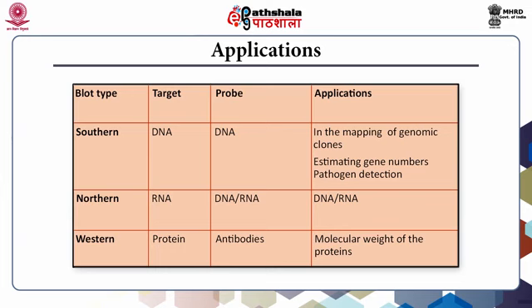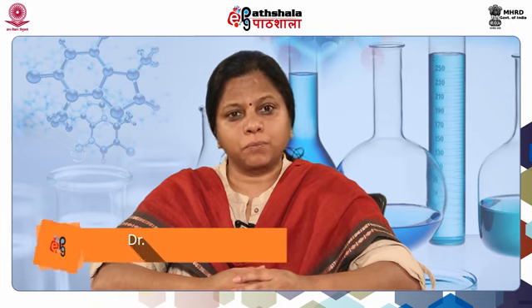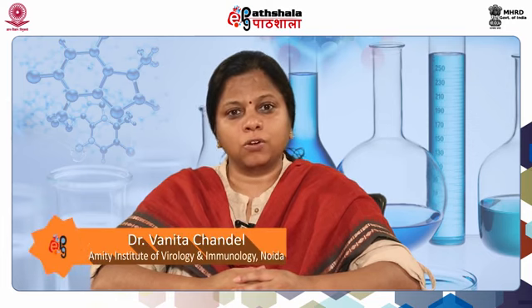of the proteins. So, students, after this module you will be able to define blotting, types of blotting, principle of blotting, procedure of blotting and various applications of blotting.